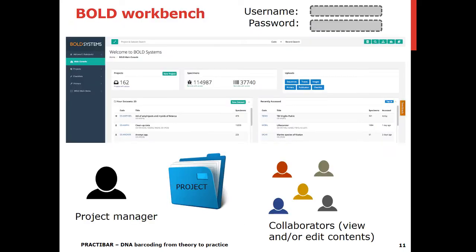And now I'll move to talk about the most exciting part for any researcher — the workbench provided by BOLD. Hopefully you will get a picture of how complex the DNA barcoding approach is and how issues occurring at different steps in a certain lab or research group can impact the outcome of an analytical workflow in a different lab or regulatory agency such as yours. To access the workbench, an account is needed for data security, but the account is free and quick to set up. Once you log in, you see a console — this is the command panel for your work. Data cannot just freely float in BOLD; data needs to be hosted in projects. The first step is to create a project, and the person who does that becomes the project manager, with power to give or cancel access to various collaborators at different levels.